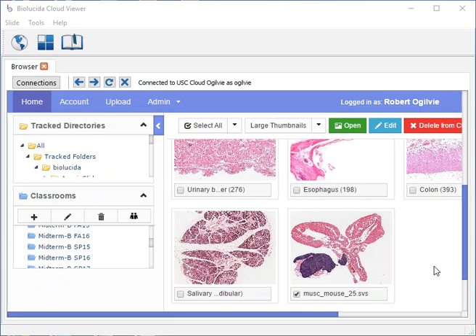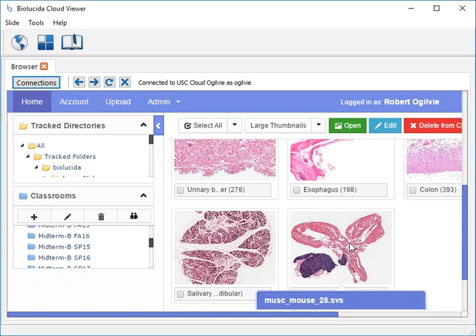The specimen that we'll give an overview of is a specimen that contains brown and white adipose tissue. And we're needing to use a non-human, a mouse tissue. So that's what this specimen is here.